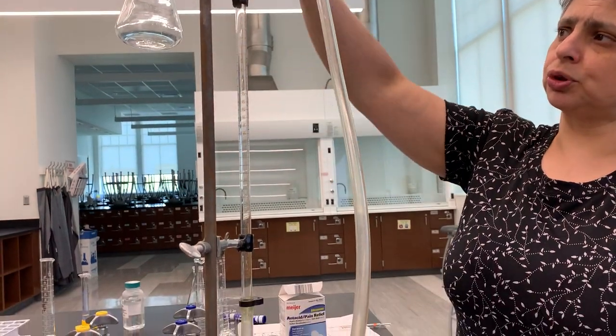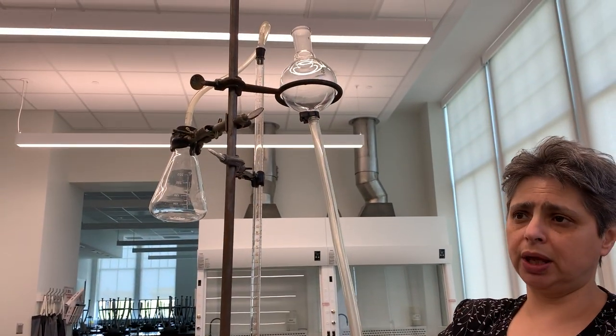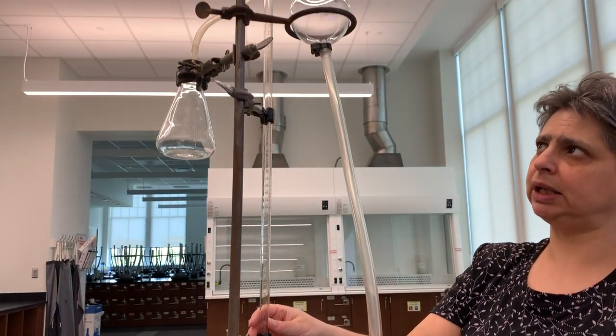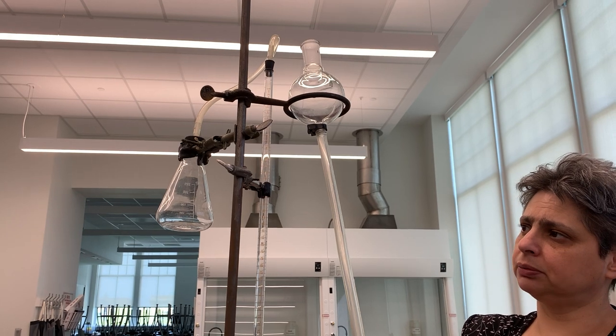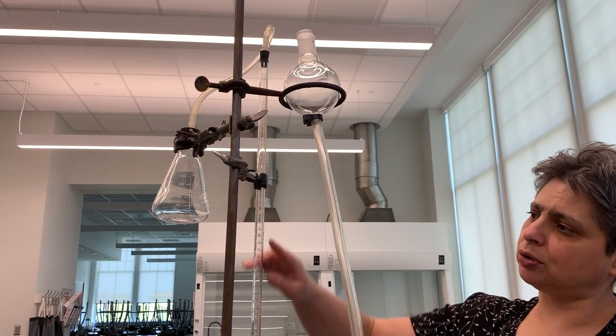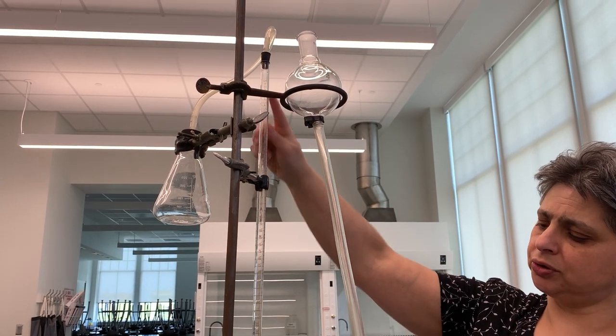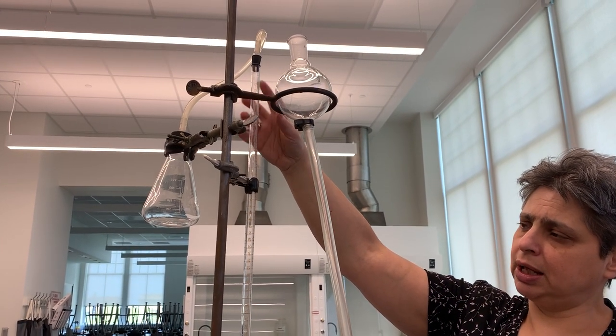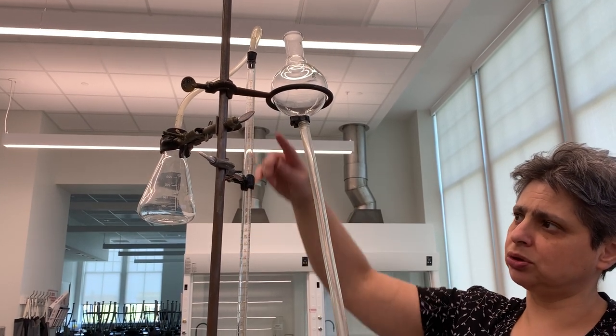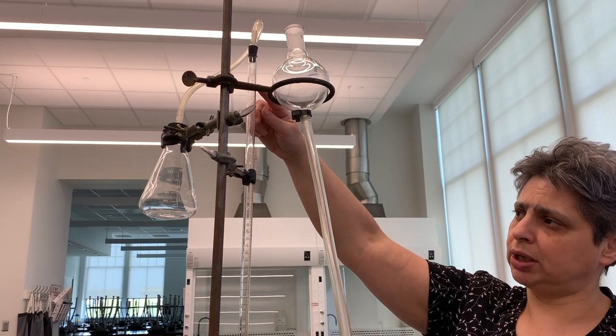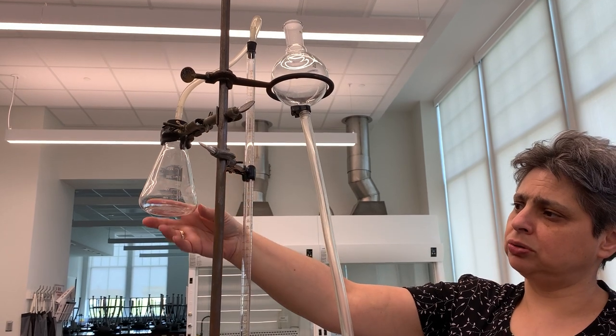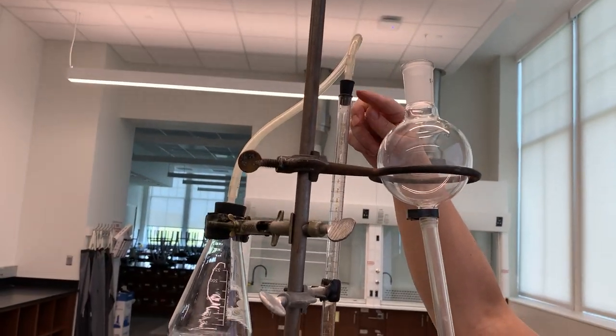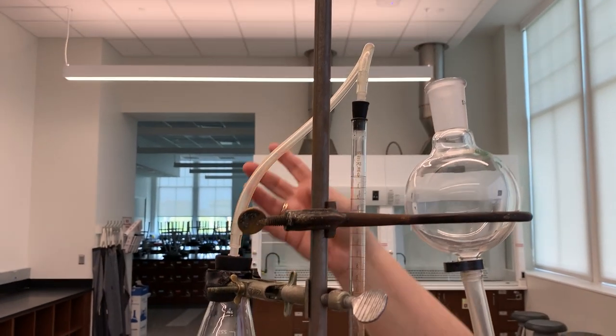So the setup includes three major parts. In the middle here, you see what's called a burette. Unfortunately, you did not get to use a burette for titrations because of lockdown and issues with public health safety. We could not be on campus back in early April. That's when we would have done this experiment. So burette is right here. It's graduated from zero on top to 50 on the bottom. So zero's on top because typically when burette is used, it's filled with liquid. And then as you empty the burette, numbers increase. It means you dispense more and more liquid into your container. But here, burette is going to be filled with liquid and then the reaction between Alka-Seltzer piece and HCl will take place in this reaction flask. As you can see, reaction flask is connected to the burette via this tubing with the stopper on top. All of this is supposed to be airtight, so no gas will escape. So any CO2 that's formed, most of it anyway, will be going through the tubing, will enter the burette, and then will push the liquid down.